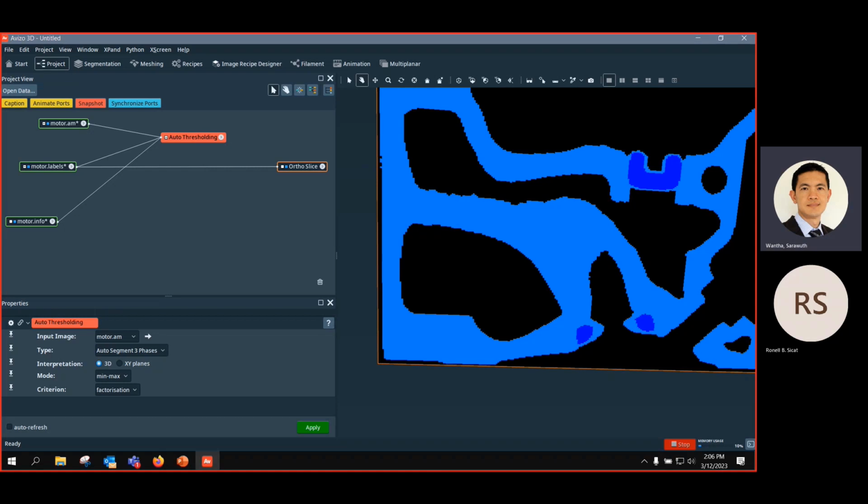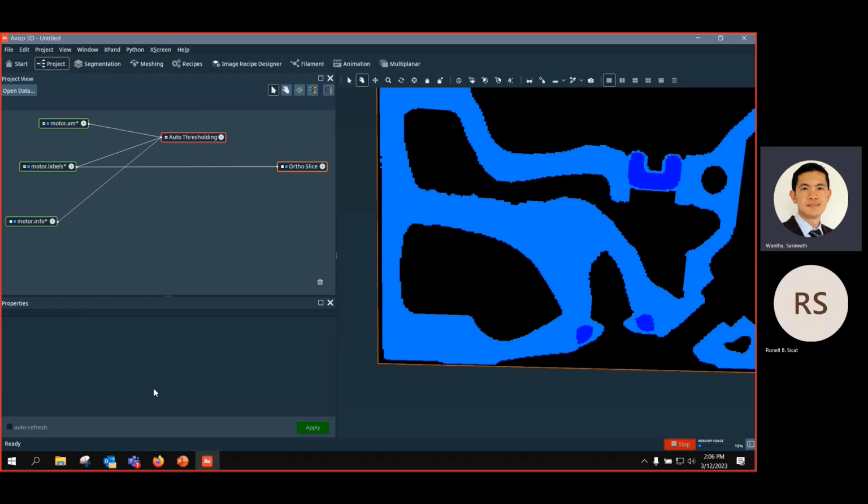Okay. What we're doing so far, what we create here, is called automatic thresholding, automatic segmentation. So everything can be done using all the modules. You apply the module, you get the final result. This is automatic, and everything that has this automatic module that you apply here can be created as a batch processing file as a recipe. So this is why we call it automatic segmentation.